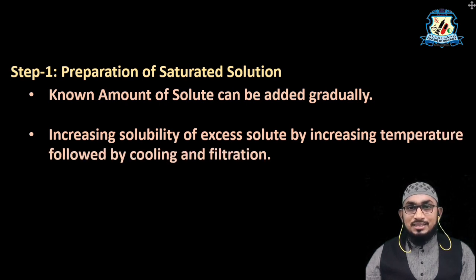In this method, what we will do is add some excess amount of solid in the solvent and heat it, and definitely it will increase the solubility of that solute, and upon cooling followed by filtration we will get a saturated solution.